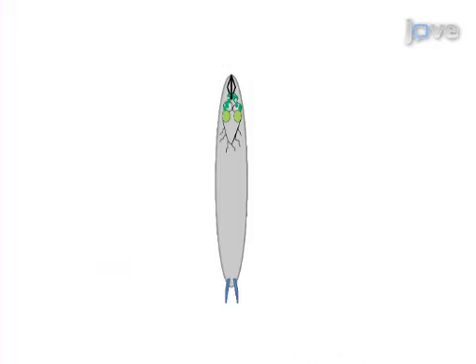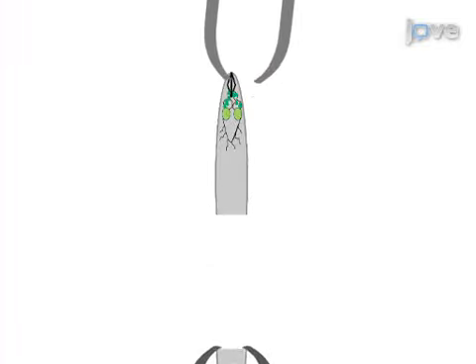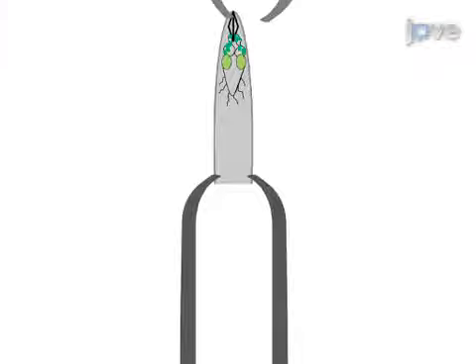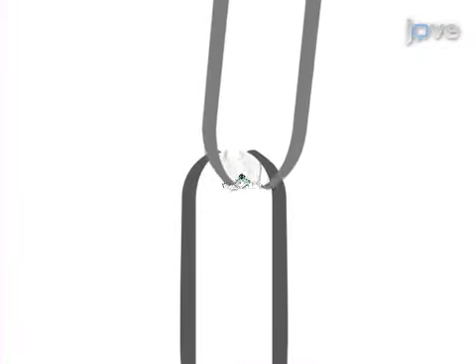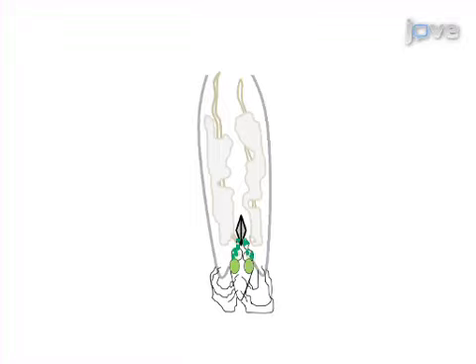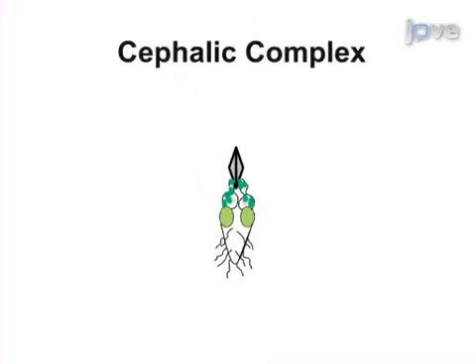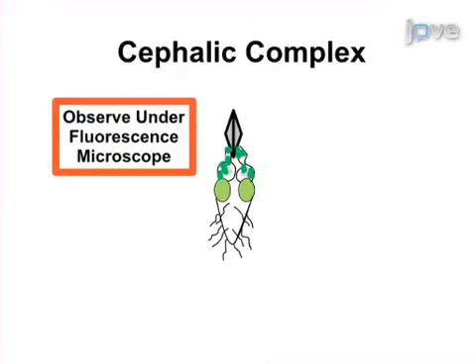The next step is to dissect the selected larvae to expose the cephalic complex by first cutting them two-thirds of the way down, securing them, and then turning them inside out. Next, fat body and gut tissues are cleaned off, and then any nerves still attached to the ventral nerve cord and the larval epidermis are also broken. The final step is to image the cephalic complex or fix it for downstream applications.